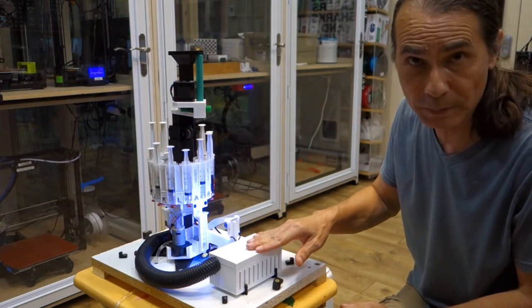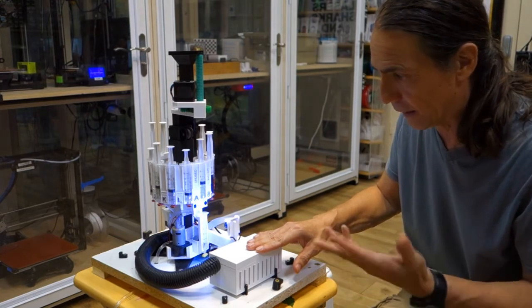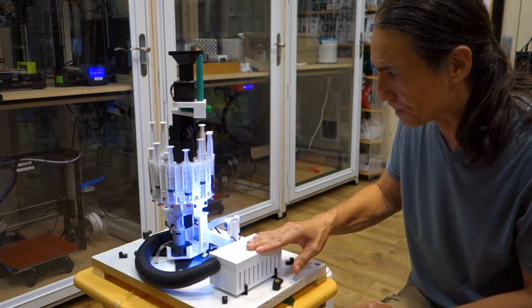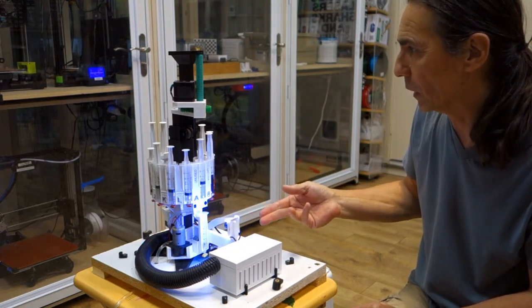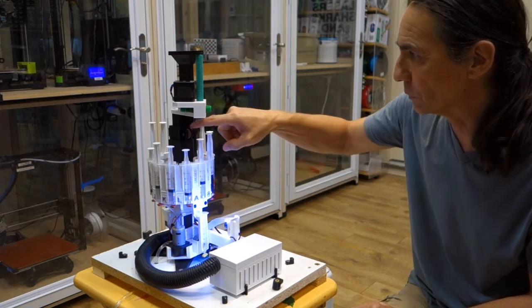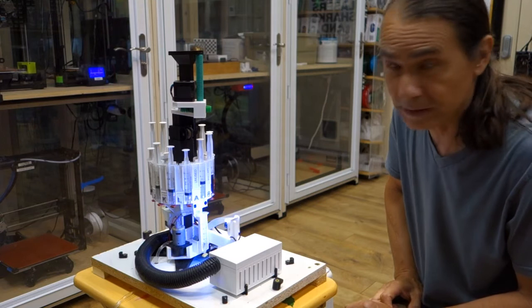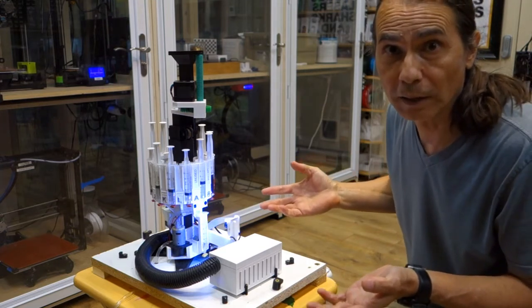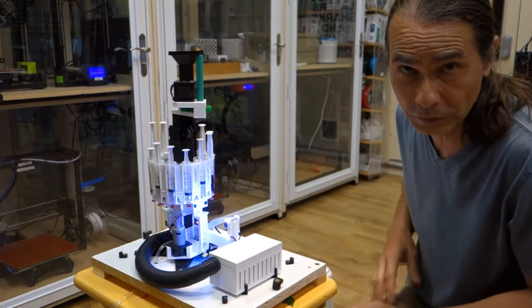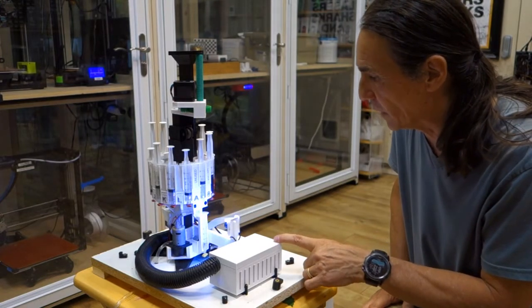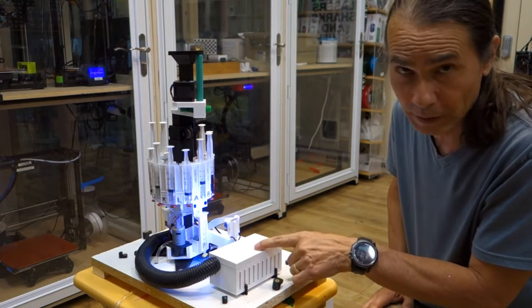So the system is run using a Raspberry Pi. In this case the Model 2 or Model 3. It's Wi-Fi. So if you have a Model 2 you need to add a Wi-Fi dongle. Pi Zero would probably also work. All the parts are 3D printed. The various motors, bearings, valves, etc. Those are all available on Amazon. My intention is to release this all open source into the community. So as part of that then the information, the URLs, all the parts that are used here will be provided. The only thing that's not really available is a print circuit board that I designed that is used for controlling the steppers and motors. And I have to figure out somehow how to make that available.